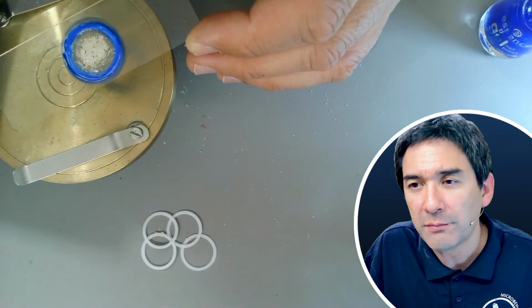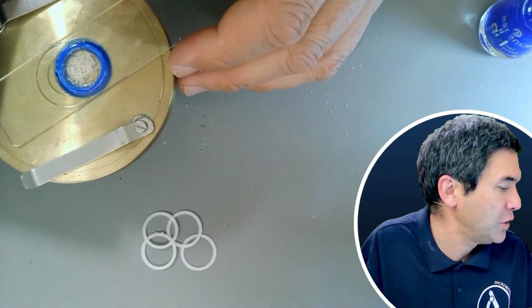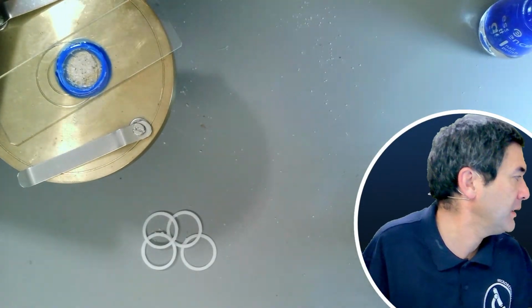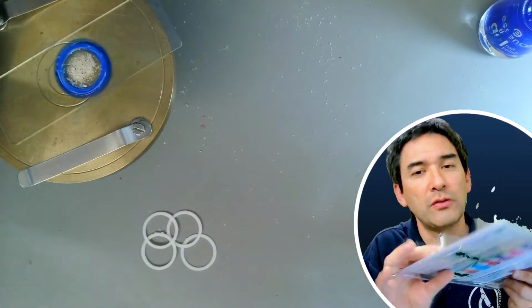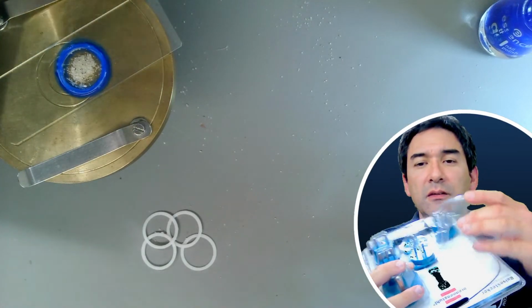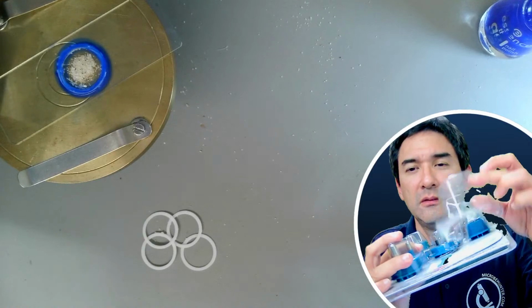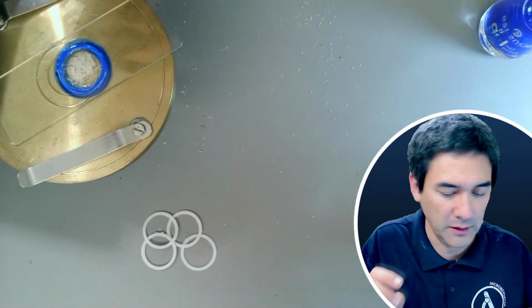Or punch rings out of plastic milk containers, sure. Or plastic packaging material. I don't know if I have something. Here it is. Look, this is just the travel adapters for electricity, but you see, there's this plastic. So that might actually be an option as well.